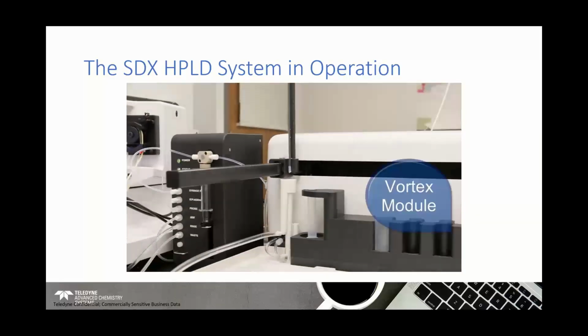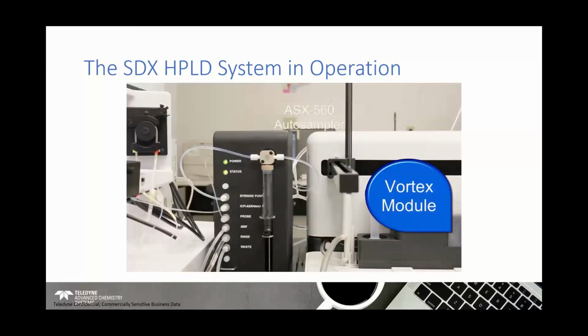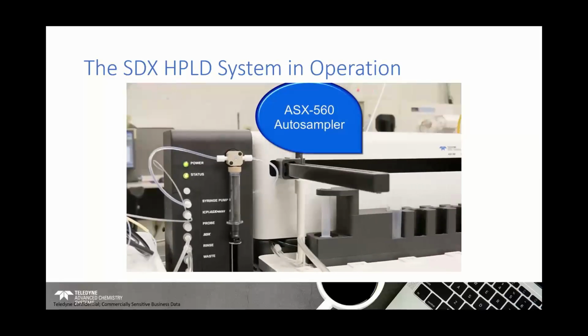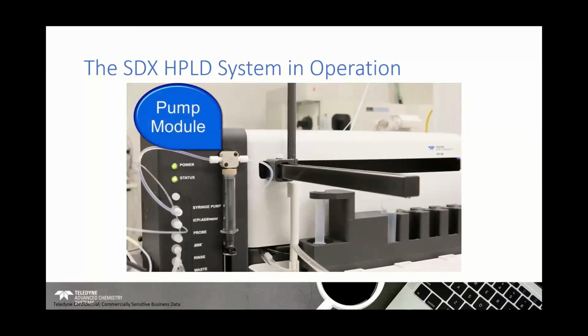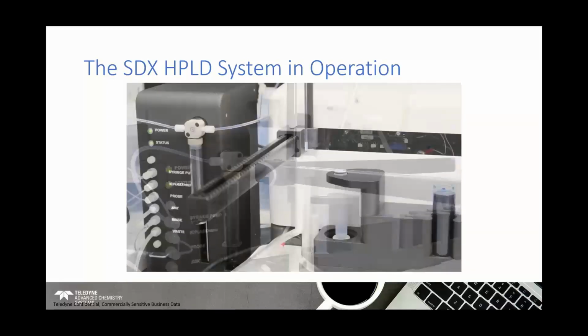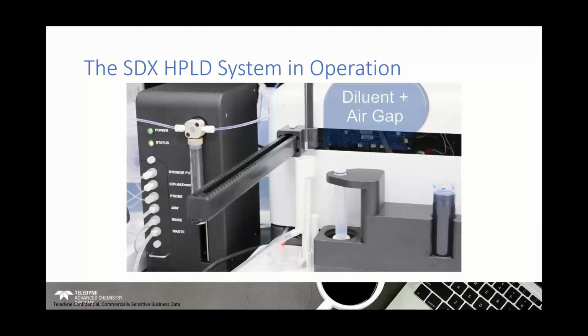And we'll just walk you through a standard sample introduction to an ICP. So we have our vortex mixing vessel in standard positions at the back of the automation, and the syringe pump module there to the left of it. And we have a sample here, which is just a blue dye. And we'll start off with just a dunk of a sample probe into the rinse station.